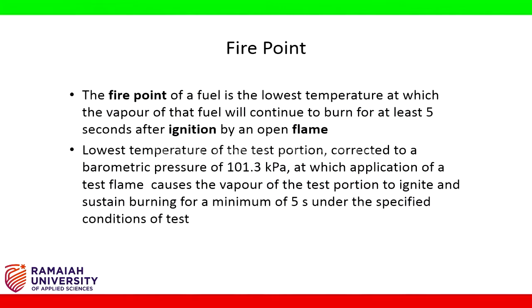Fire point definition: the fire point of a fuel is the lowest temperature at which the vapor of that fuel will continue to burn for at least 5 seconds after ignition by an open flame. Lowest temperature of the test portion corrected to a barometric pressure of 101.3 kPa, at which application of a test flame causes the vapor of the test portion to ignite and sustain burning for a minimum of 5 seconds under the specified conditions of test.